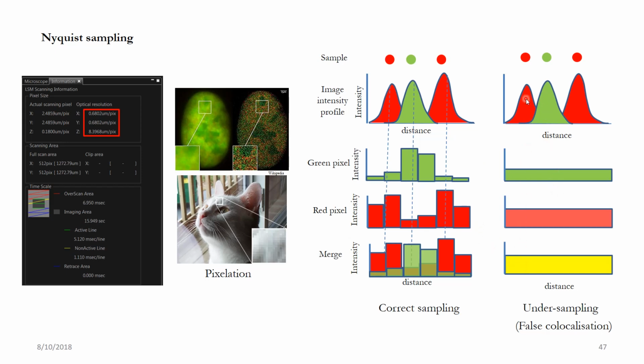And one more important point which I want to make here is that even if you are able to see co-localization in some cases, that doesn't mean that they are molecularly interacting, because your microscope can only resolve so much. This is the optical resolution it can achieve in this case. So if you want to prove there's a molecular interaction, then you have to show some biochemistry experiments.